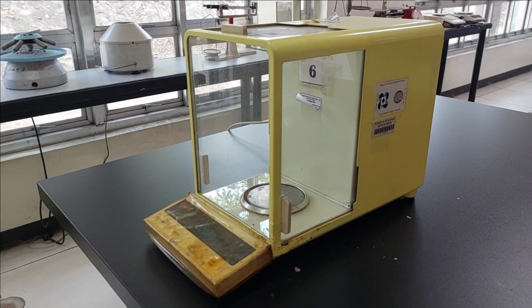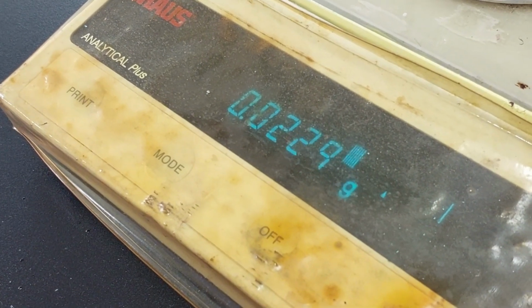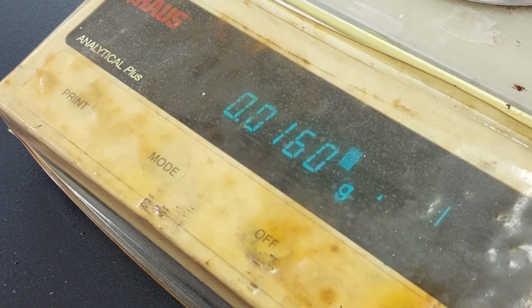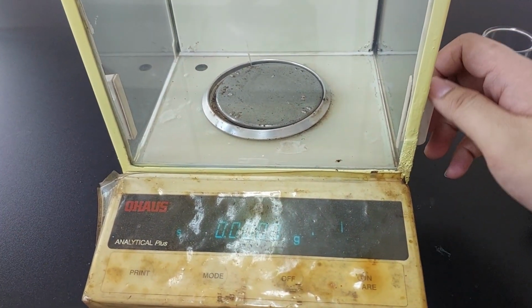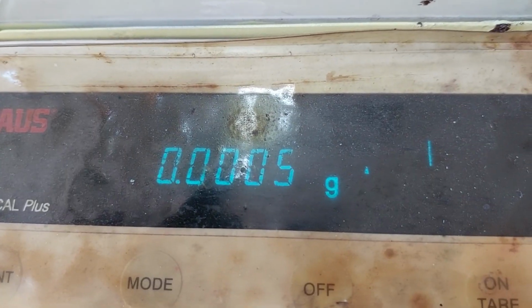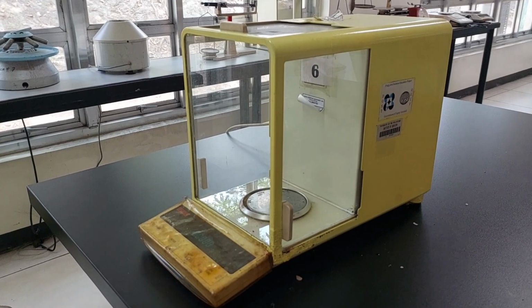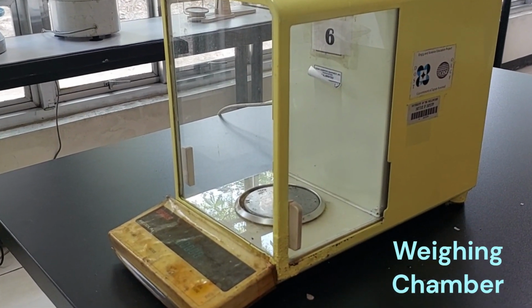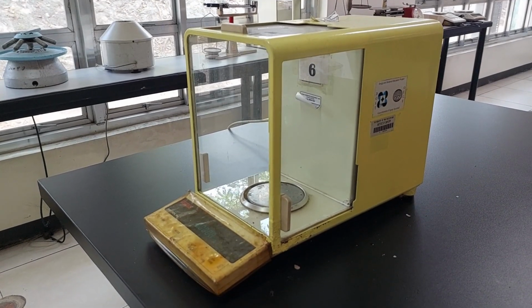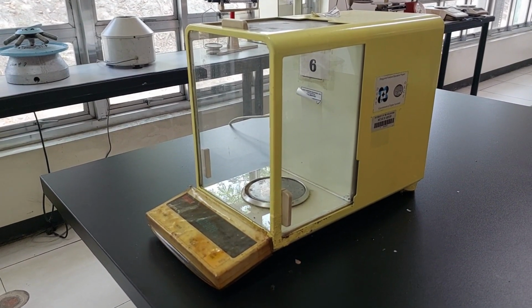In the lab, weighing is done with the help of the analytical scale, which measures the mass of an object. However, in the field of chemistry where errors are avoided, the analytical scale is made to be extremely accurate and thus very sensitive to any forces on the balance pad. This makes it prone to errors if left vulnerable to the environment. That is why it has this compartment called the weighing chamber to make sure that only the object of interest is being measured. Now that you guys are familiar with the instrument, let us now go to the weighing techniques that make use of it.